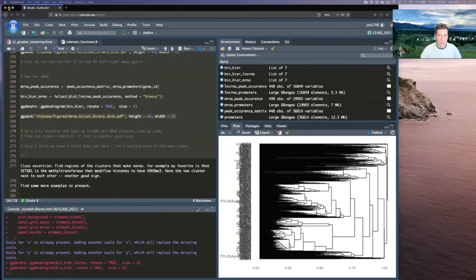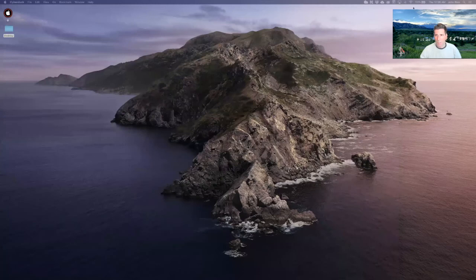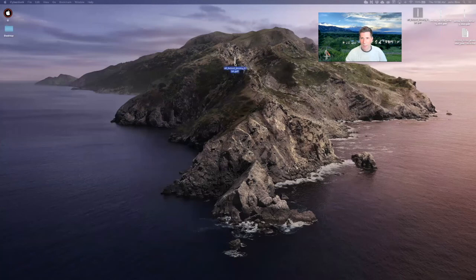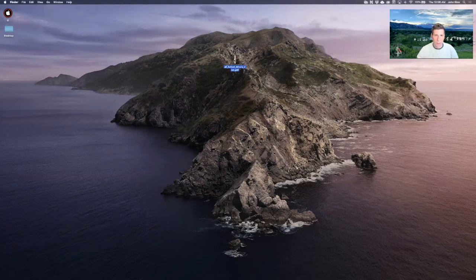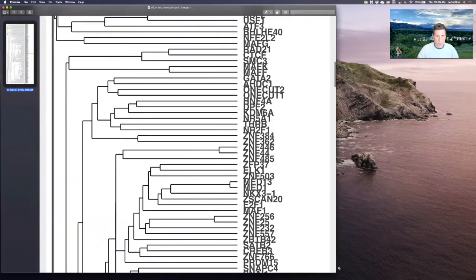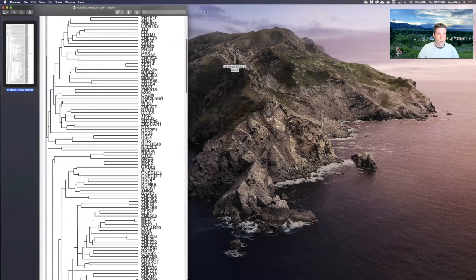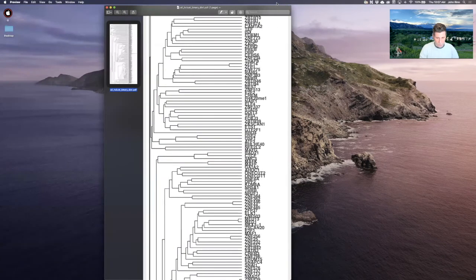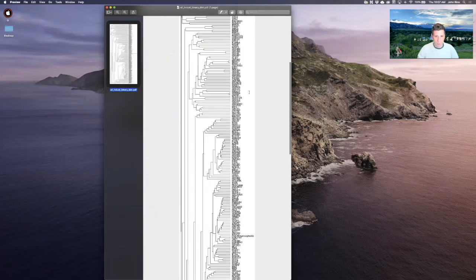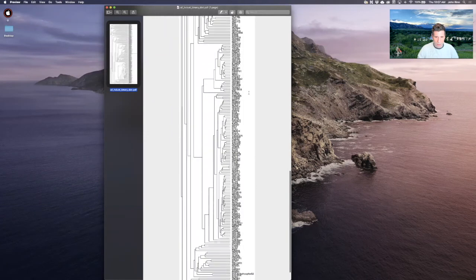And let's do that real quick. Where these files are here. I'm just going to do the total for today. You can look at the long non-coding RNAs versus mRNAs later, but now you can see we can actually get somewhere here by scrolling and making it bigger, zooming out if we wanted, that it's a little more readable than what we were seeing in RStudio. But look at all this data.